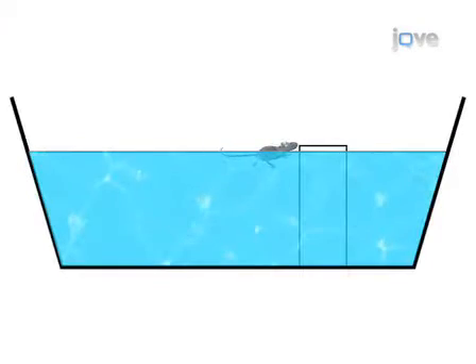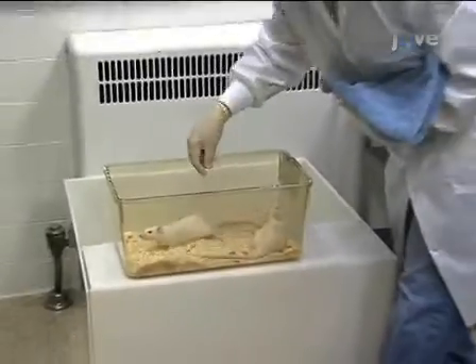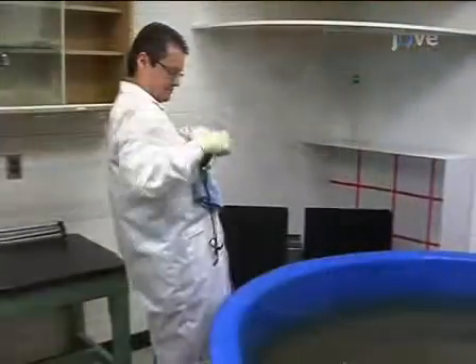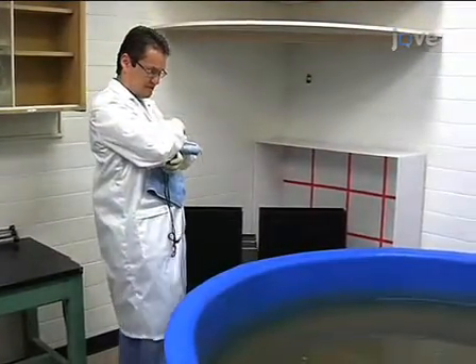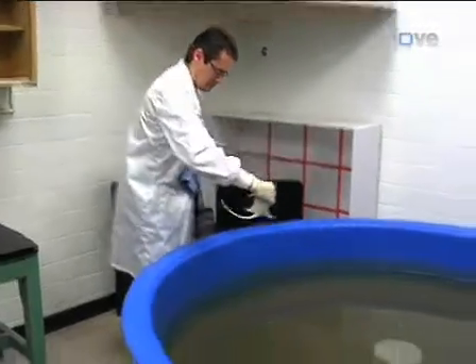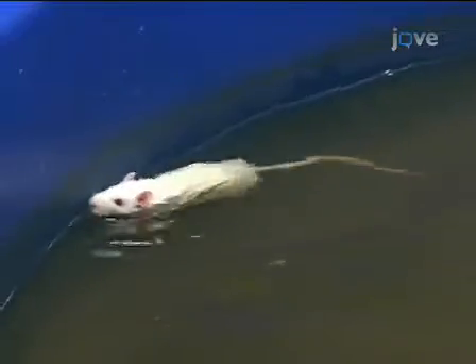Now we are ready to begin the training of the animals in the water maze. The water maze has four starting positions: north, south, east, or west. Take the animal to one of these positions. Lower the animal to the water by supporting it with your hand, and bring it down gently into the water tail end first. Do not stress the animal out by dunking its head in the water.